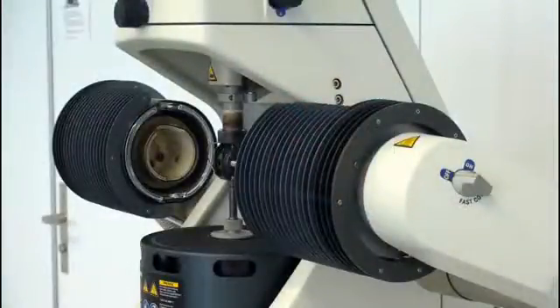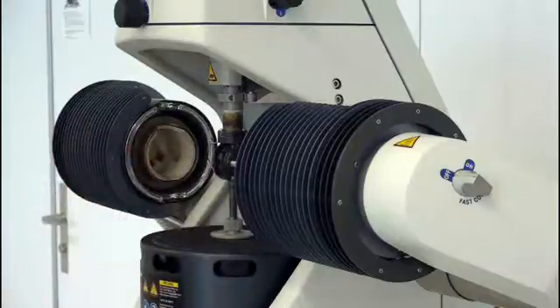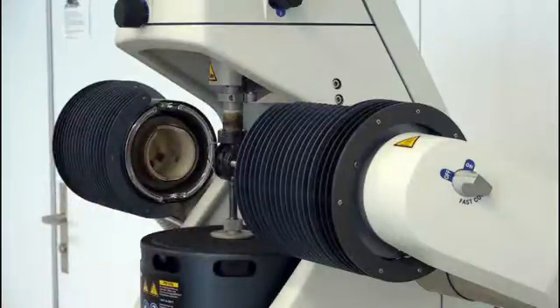Someone said: if I only could take out the clamp of my clamping assembly, this would really help me a lot. It's such a headache to clamp my thin fibers with the old instrument I am currently working with. That's why our engineers put so much effort into furnace design, which is as small as possible to eliminate undesired temperature gradients, still large enough for bigger samples, but most importantly, easy accessible for sample handling.